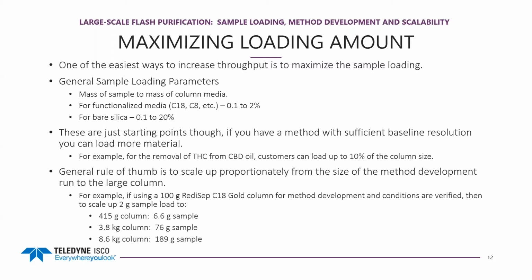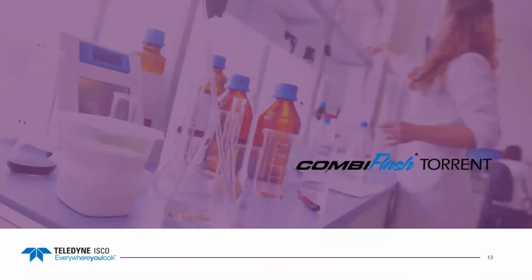So the sample loading is traditionally lower than we find for silica. If you're on a silica column, you would be able to load significantly more as a maximum, depending on your purification.